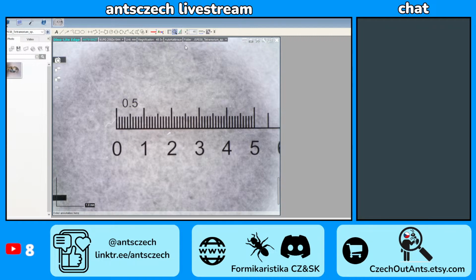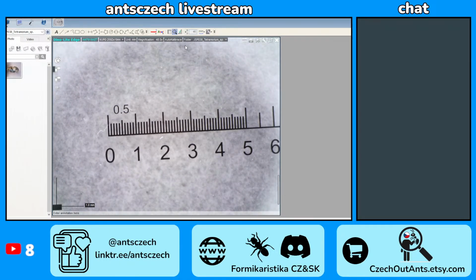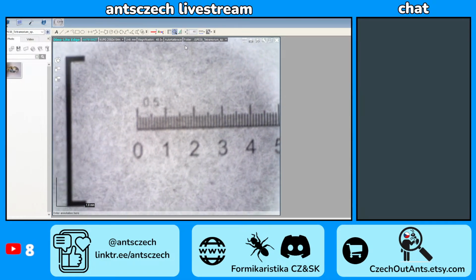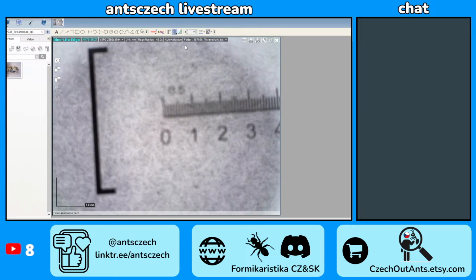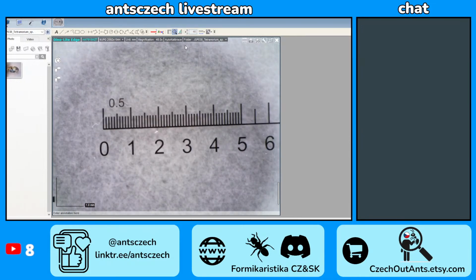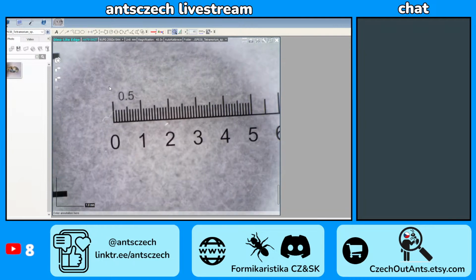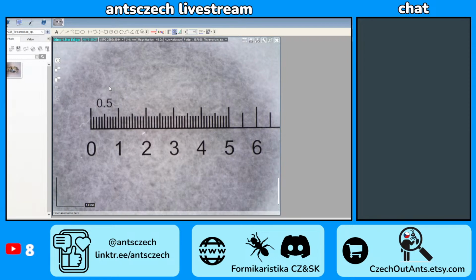And yeah, you use the SCM 902, right? You use the stereo microscope, the 902, right? Or is it some other you use right now? I'm not sure which one you are referring to. Because the Carebara you posted last time was with the 902 microscope.